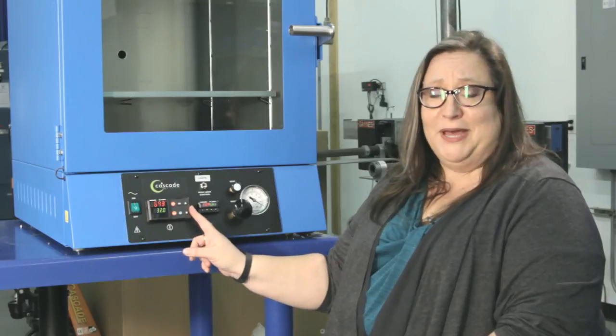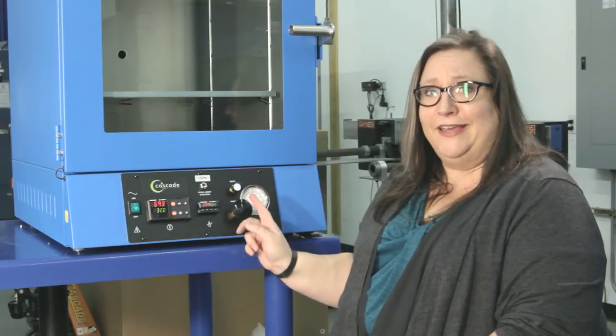So that's it. Turn it on, up arrow up, down arrow down, righty tighty, lefty loosey. No calibration, no changing the settings for each step point. It's easy to use, and now you're ready to go. Check us out on Facebook and Instagram, and if you have any questions, just give me a call.